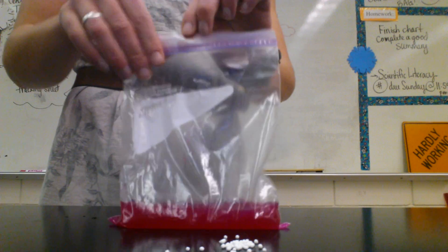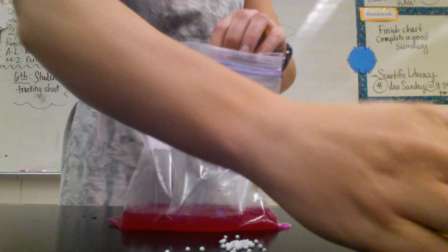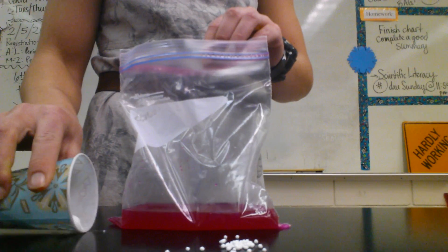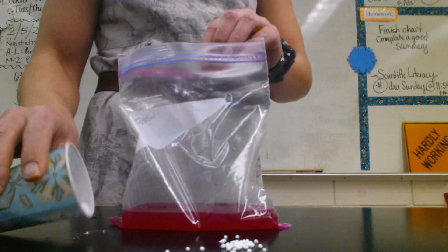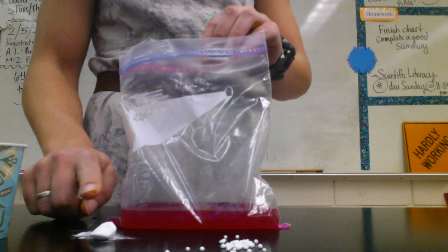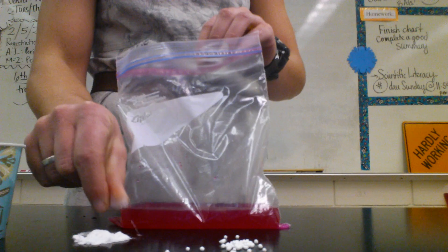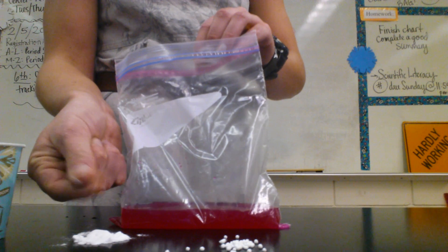Reaction number three involves sodium bicarbonate, which you all learned was baking soda. I'm just going to pour a little bit out right here. You can see it's a very different solid than the other one — it's like a powdery solid, not crystal-y.